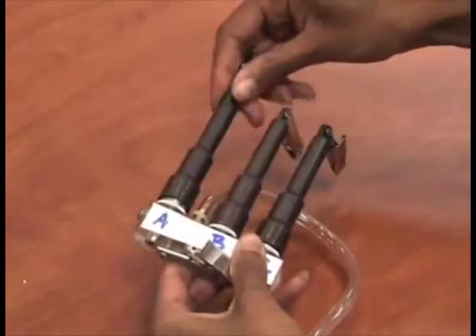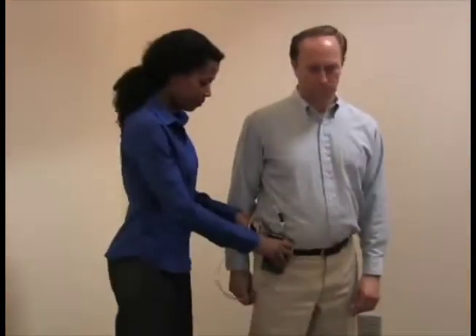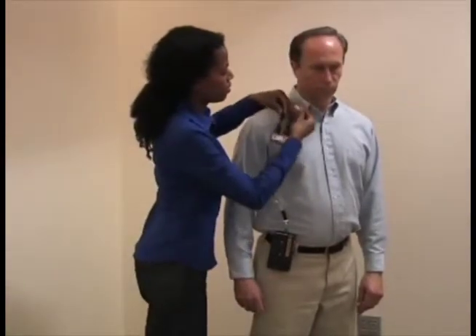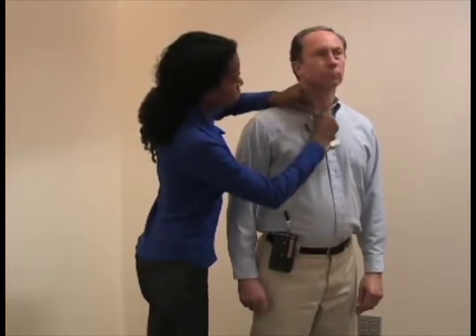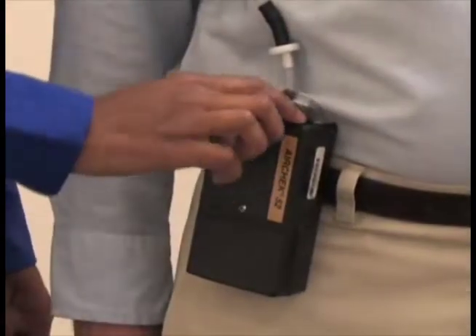Remove the calibration media, cap it, and mark it for post-calibration. Install new media for sampling into each port of the splitter and screw on the tube covers over each tube. Attach the pump to the worker's belt toward their side or back. Attach the splitter on or near the front of the shirt collar, or as close as practical to the nose and mouth of the employee. Position the excess tubing so that it does not interfere with the work of the employee.